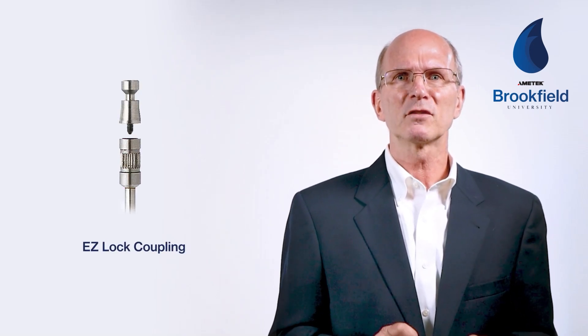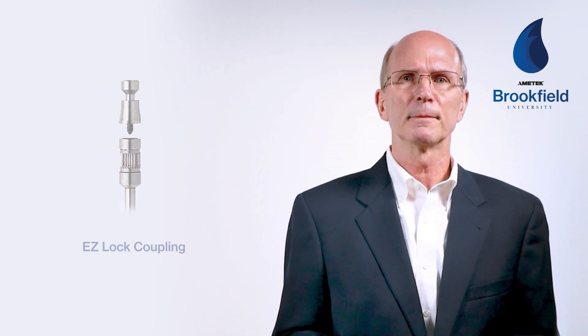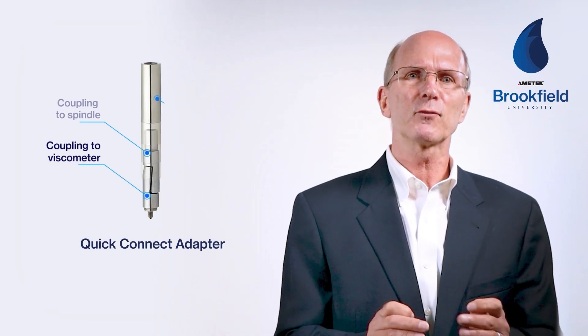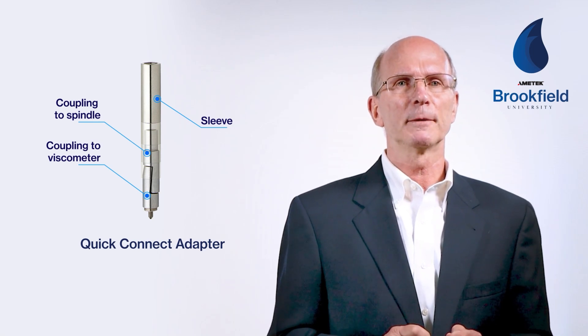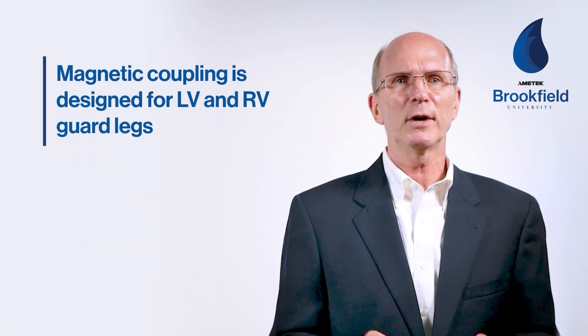Guard legs also come in different lengths depending upon your spindle coupling system. The EasyLock coupling system is longer than the standard threaded spindle, which requires the guard leg to be lengthened. You can see the difference between the threaded coupling guard legs on the right and the lengthened EasyLock guard legs on the left. Also, the quick connect adapter for threaded spindles adds length to the standard spindle and requires a modified guard leg. The new magnetic coupling system has been designed to use the standard LV and RV guard legs.